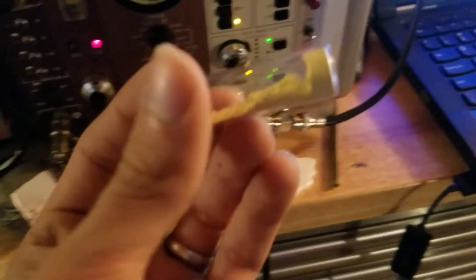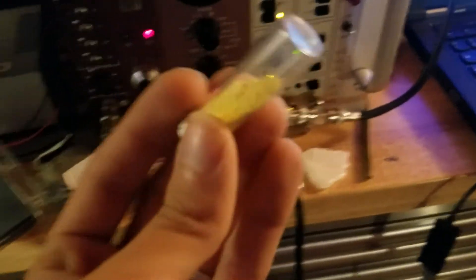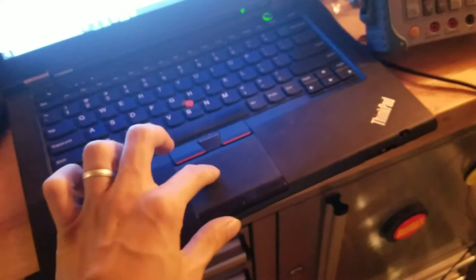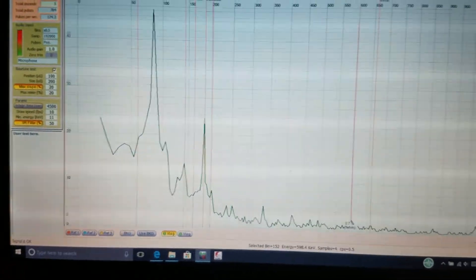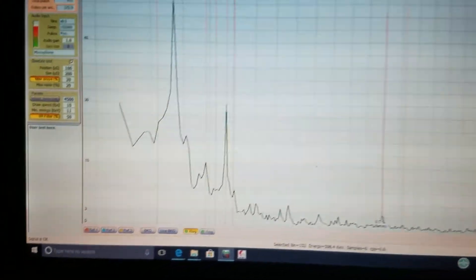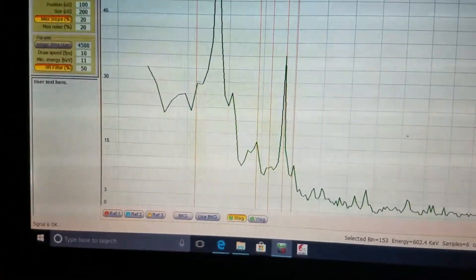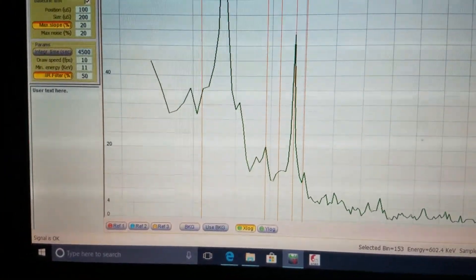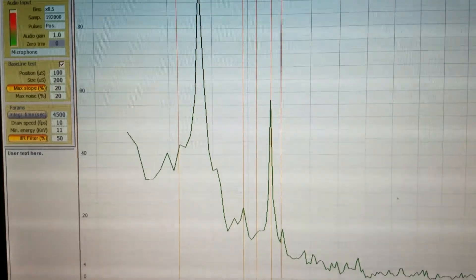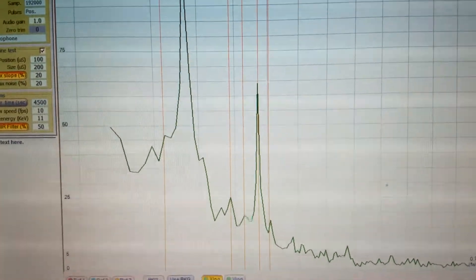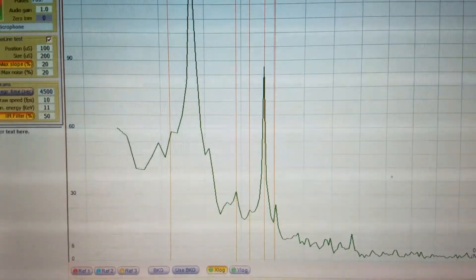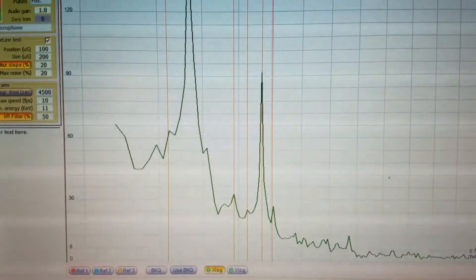This is a small sample of yellow cake. We'll see what it does. And right away you can see the main U-235 peak and the other three coming in.